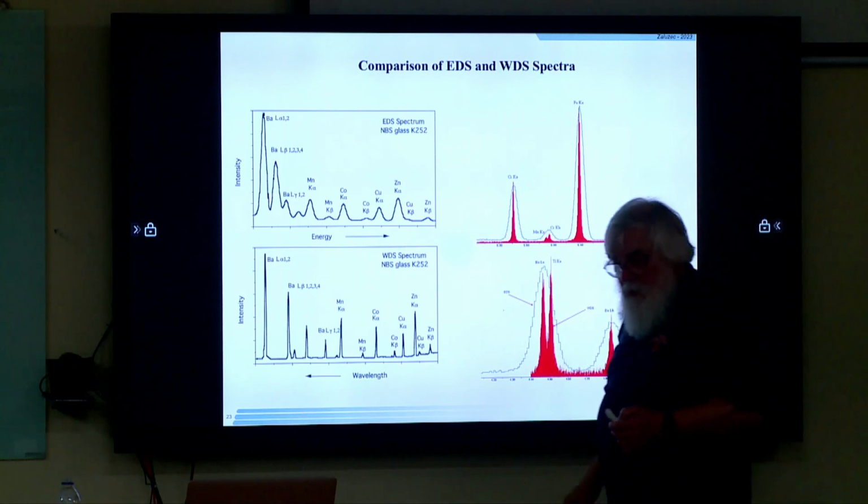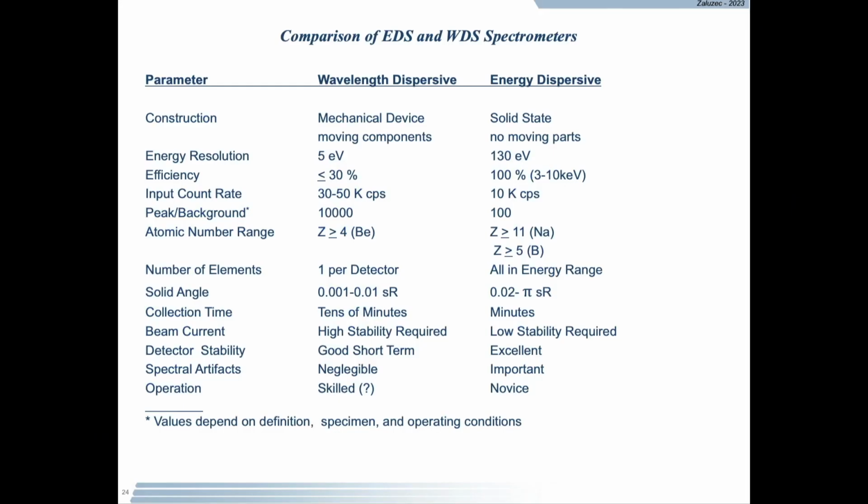Okay? Is there another solution? Yes, EELS, but that'll be tomorrow. So we won't spend any more time about this. I already described it. We're mainly going to be talking about EDS type spectrometers.